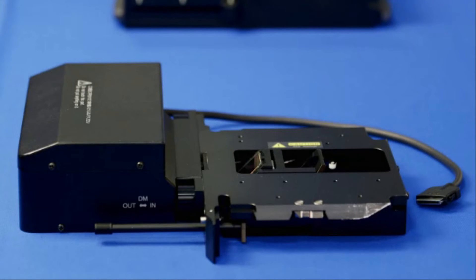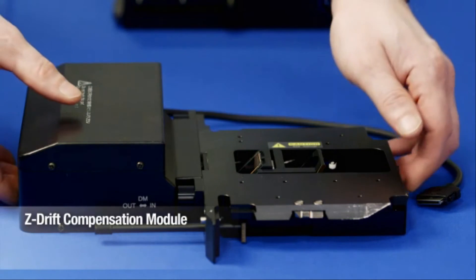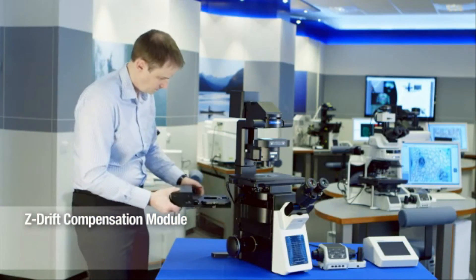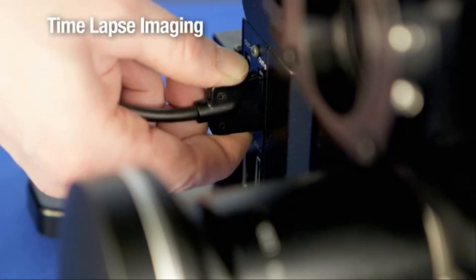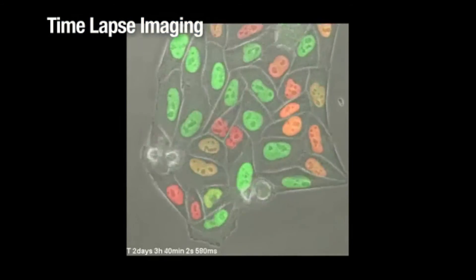The Olympus Z-Drift compensation module is an available upgrade for the IX83 model shown here and automatically maintains precise image focus. This is perfect for time-lapse experiments, such as this three-day time-lapse capture of cell division labeled with a fluorescent ubiquitination cell cycle indicator.